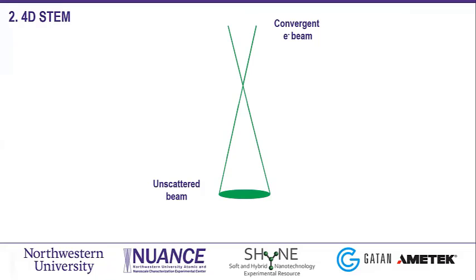Now, with the evolution of hardware and, later, of detectors in recent years, you can capture those simultaneously with scanning transmission electron microscopy. So this is an introduction to 4D STEM.